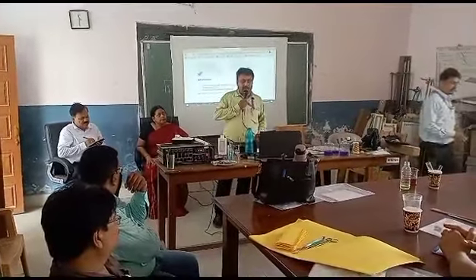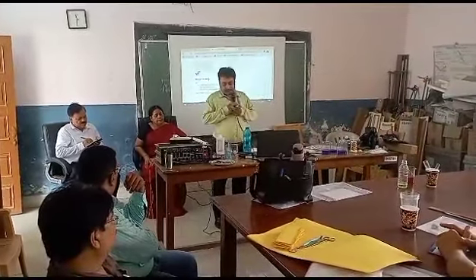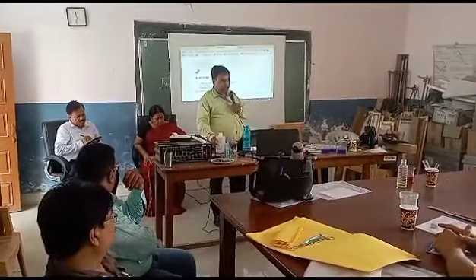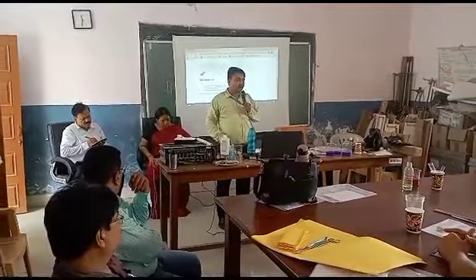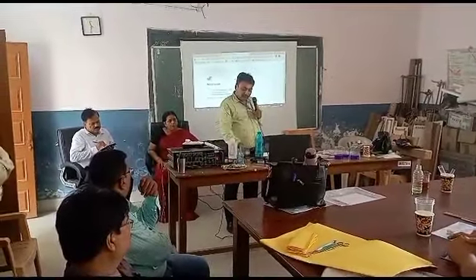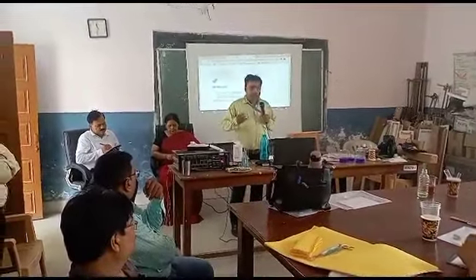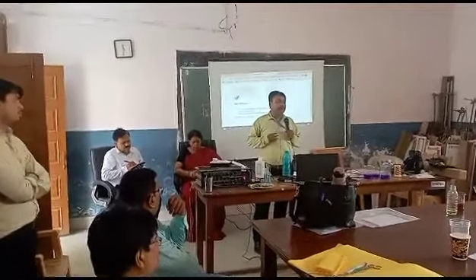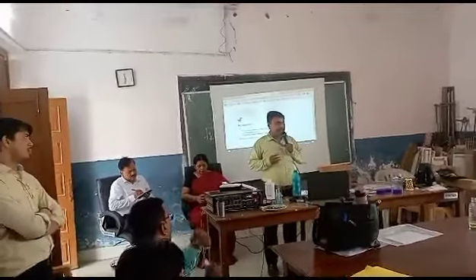Thank you for this opportunity. I am showing you how to extract DNA.